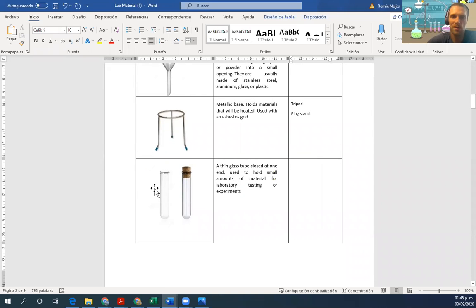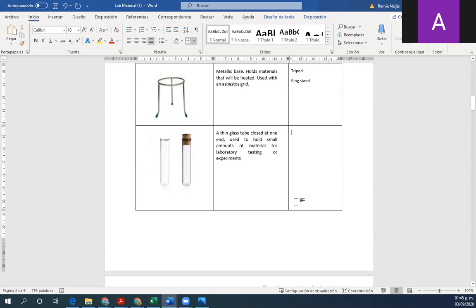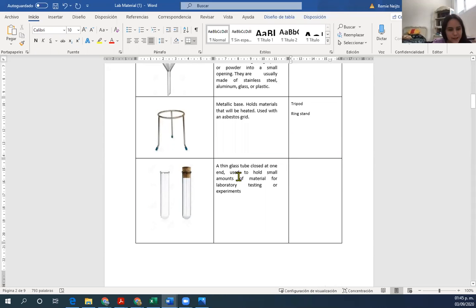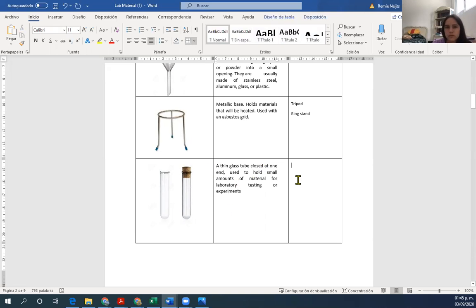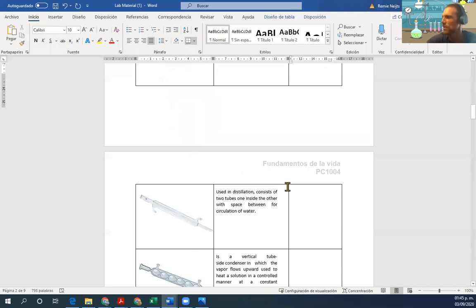Yeah, this is super easy. Who wants to do that one, Gretel? Haven't heard you. Well, for the description, it sounds like a distillation tube, but this one is not a distillation tube. We saw it in the quiz thing, which we did before in Canvas. It's like the most commonly used thing in a laboratory, in fact. Test tube. Yeah, of course, it's a test tube. We have many of those as well.